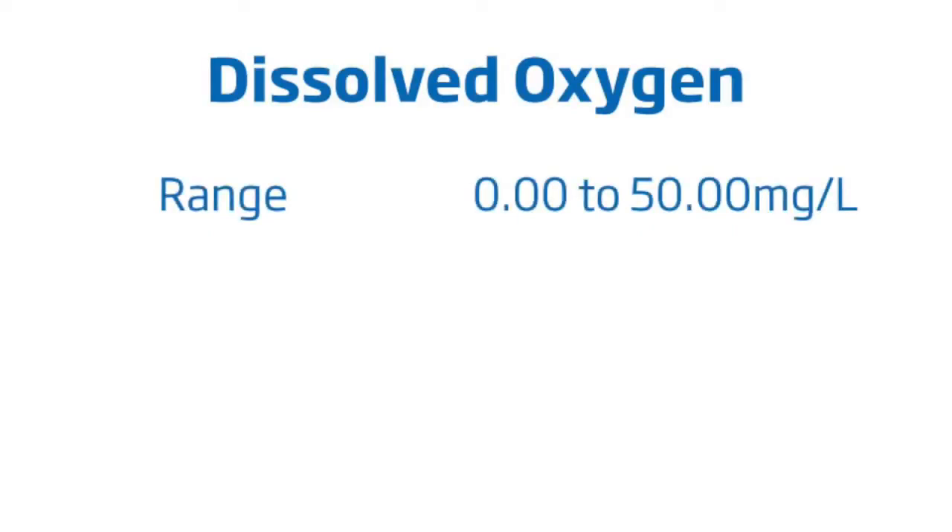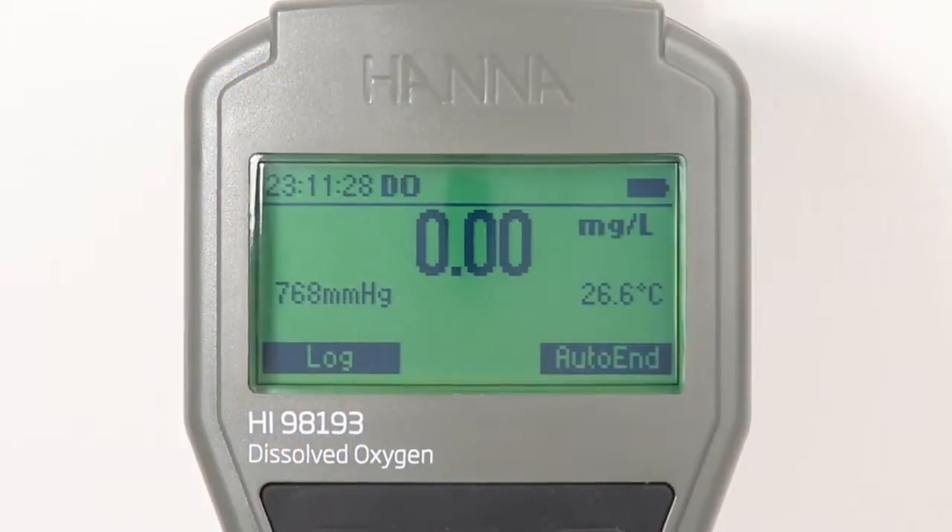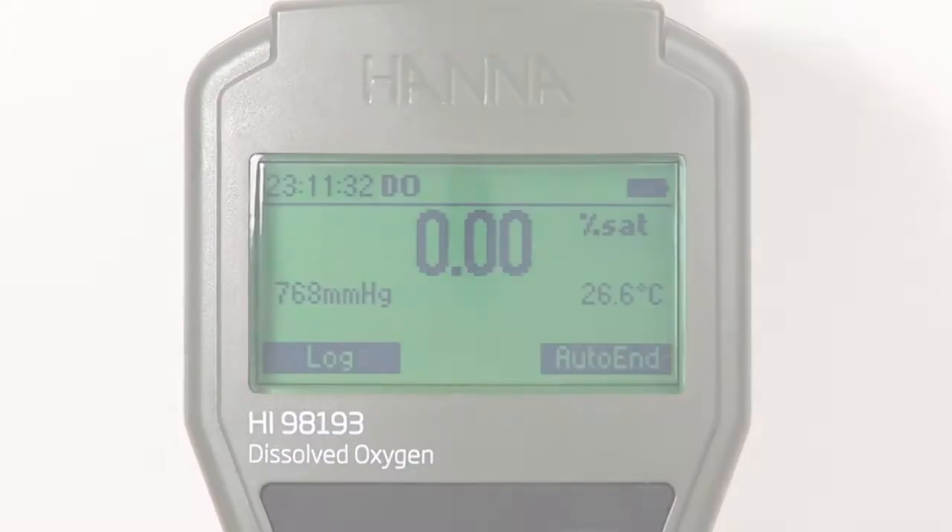The HI-98193 has a dissolved oxygen range from 0 to 50 milligrams per liter with an accuracy of 1.5 percent and a resolution of 0.01 milligrams per liter. Measurement modes of DO in milligrams per liter and percent saturation can be switched with the push of a button.